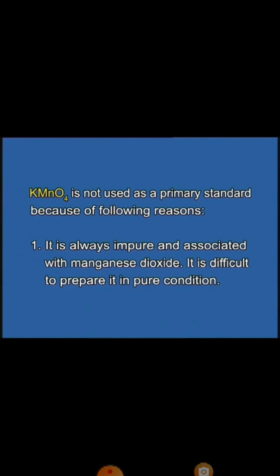Why is KMnO4 not a primary standard? We will learn here. KMnO4 is not used as a primary standard for the following reasons. First, it is always impure and associated with manganese dioxide. It is difficult to prepare it in a pure condition.